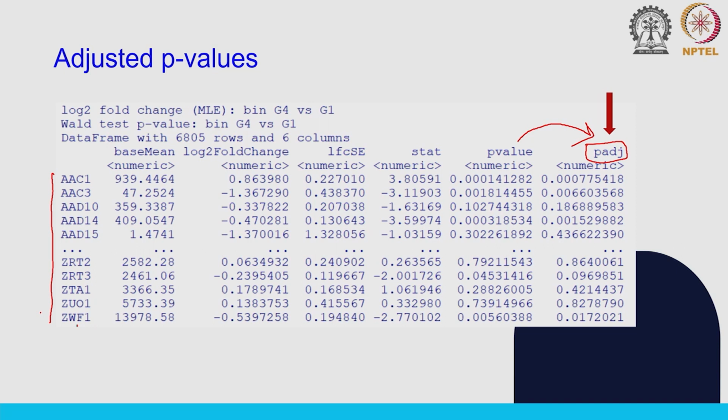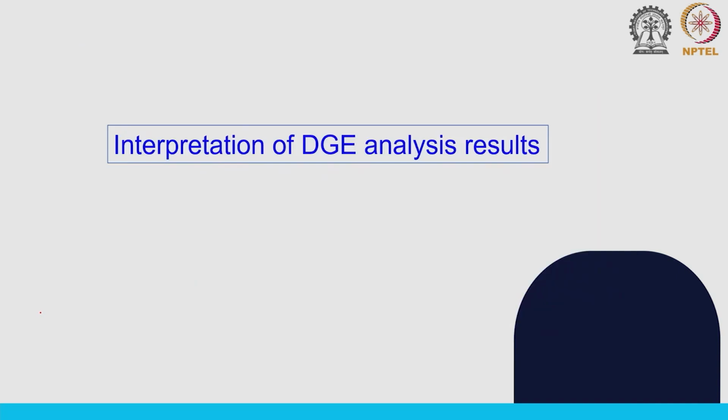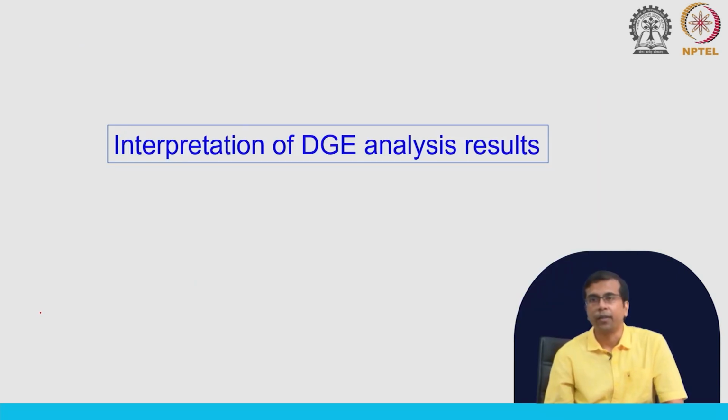Okay. So, we have now talked about this FDR correction method, and you see, this is less conservative than the FWER methods, and they have more power in detection of the true positives. And this is why this is a method of choice now in case of differential expression analysis.